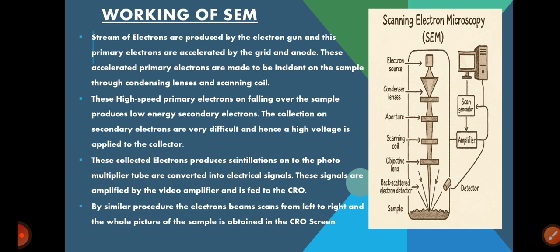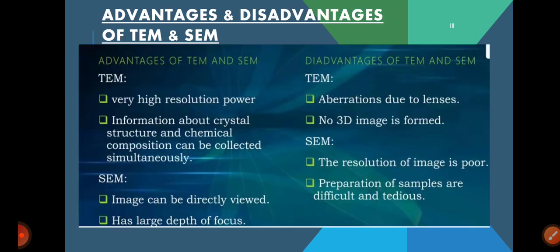So after this, let us see any operators if we consider: all operators have some advantages and some disadvantages. Like that, this microscope also has some advantages and some disadvantages. Let us see in the next slide the advantages of TEM, the transmission electron microscope.